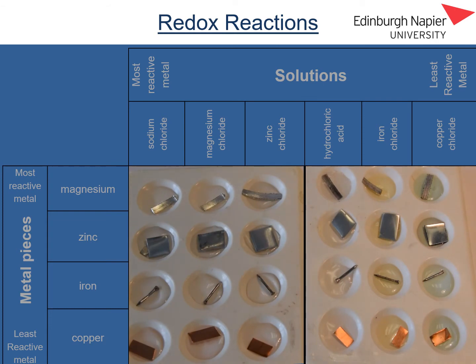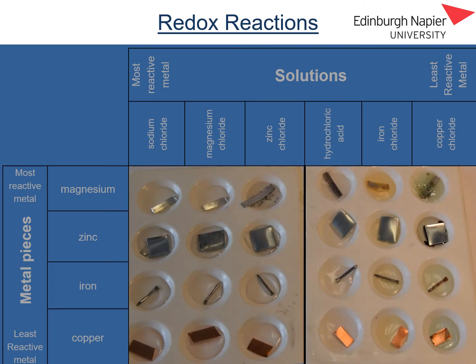Now we're going to leave these to react for a couple of minutes if a reaction is going to take place, and we'll see in which wells we can observe a chemical reaction having taken place.